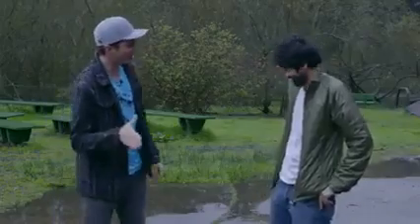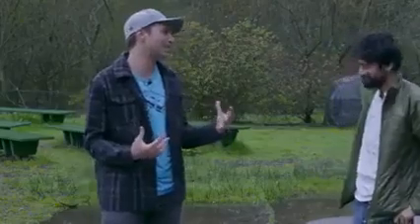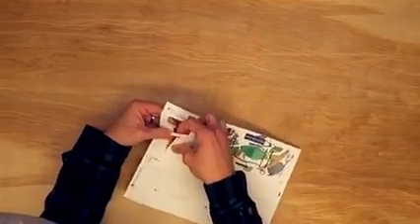Manu, good to finally meet you. You're like a superhero. From an engineering perspective, what you do is amazing. Before I continue with Manu, let me just support that statement by showing you how this 50-cent paper microscope actually works.